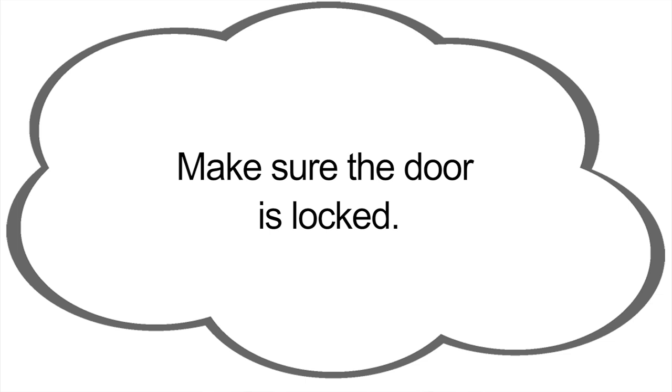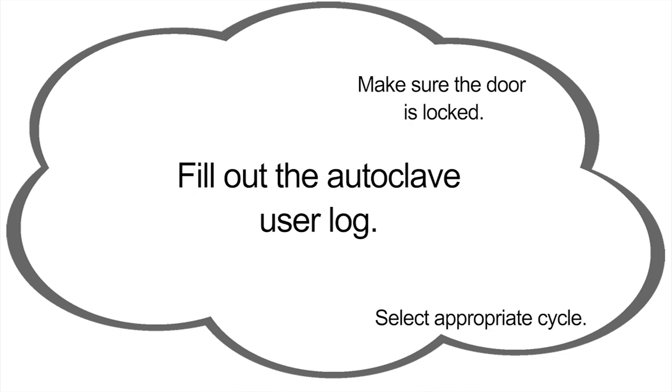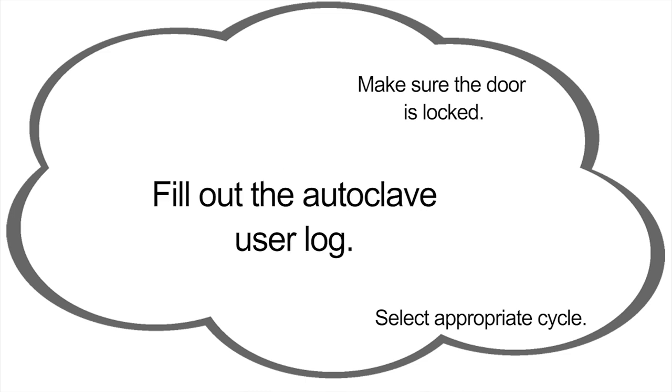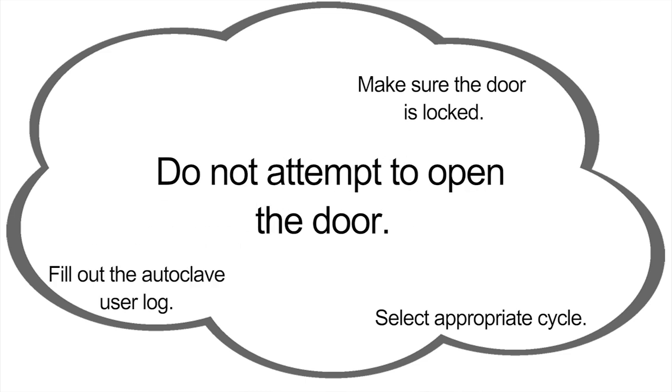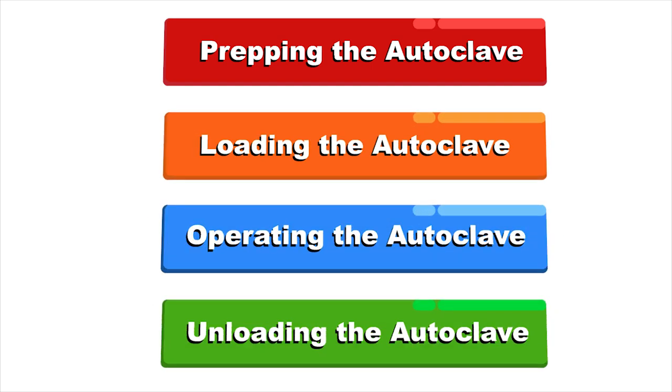To summarize operating an autoclave: make sure the door is locked securely. Select appropriate cycle. Fill out the autoclave user log. Do not attempt to open the door while in operation.